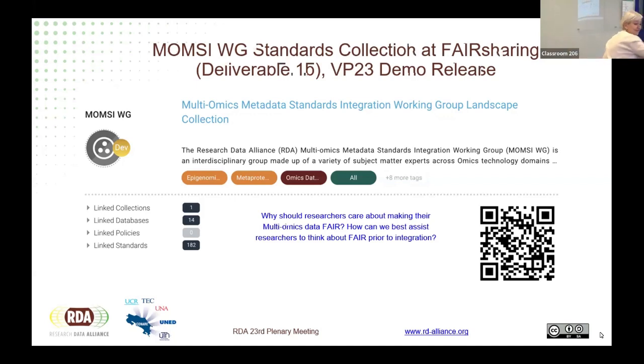Yeah. And let's not forget the life cycle, for each step along the whole experiment and study, you use different ontologies. If you're preparing a sample, you use the sample ontology, relevant to say metabolomics.